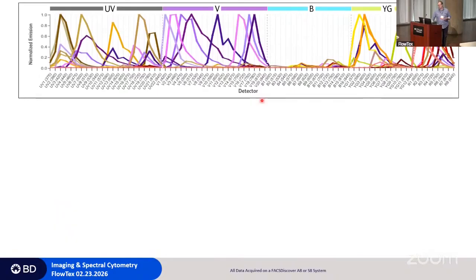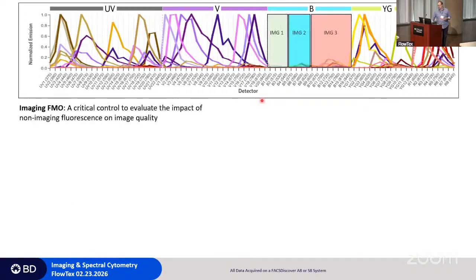And now once I put this up here, I can see where my filters are. I look like I've got some major signal in imaging channel 3, a little bit in imaging channel 2, and imaging channel 1 looks pretty clean. So again, I'm using imaging 1 for MitoTracker and imaging 3 for RB705. So I'm mostly concerned about that imaging channel 3.